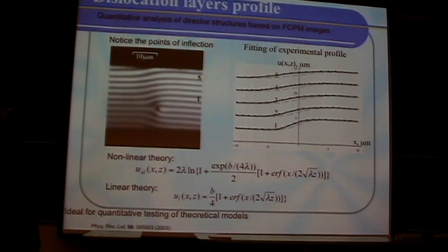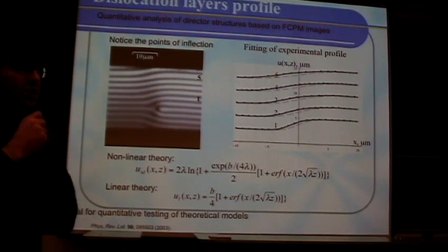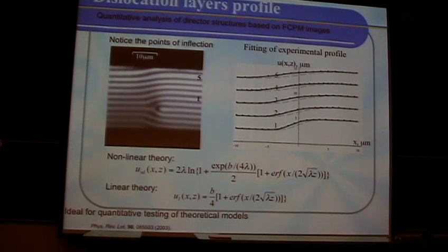Moreover, this technique allows us to achieve quantitative comparison of the experimental results obtained using the microscopy with theoretical predictions.